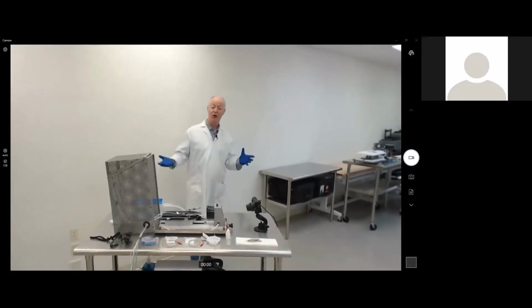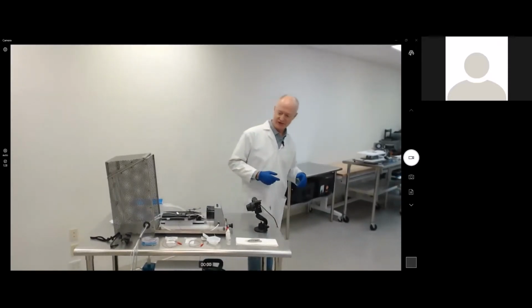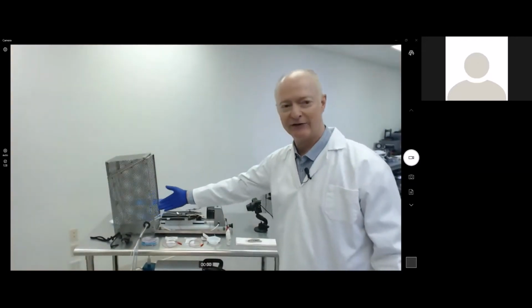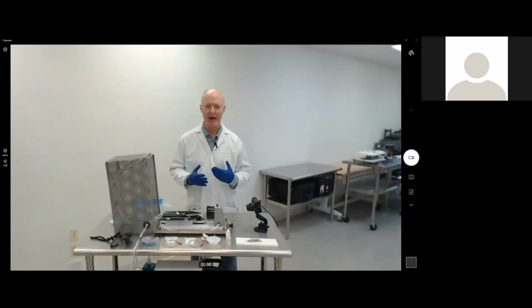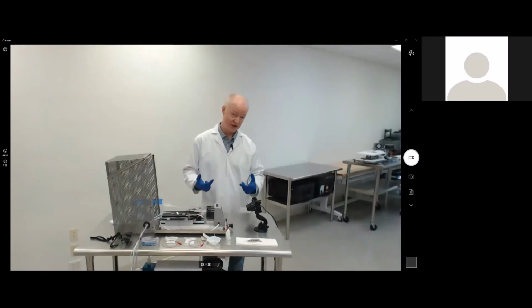So that's pretty much an overview of the system. Now let me talk about conducting ERGs. As you can see on the top here, I've put out all my essential items for conducting the ERG. When I do the mouse ERGs, I need to be aware that I'm not going to be doing it in the light as I am doing right now. I am simply showing in the light all the components so everybody gets a very clear appreciation.